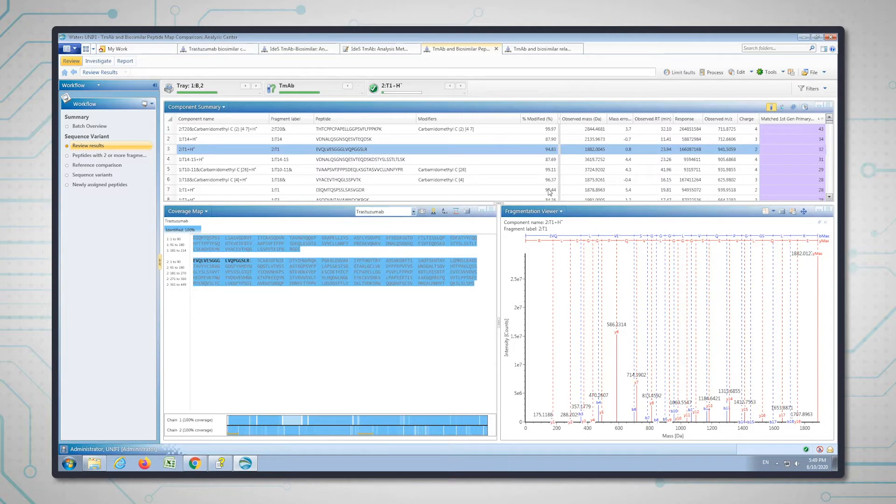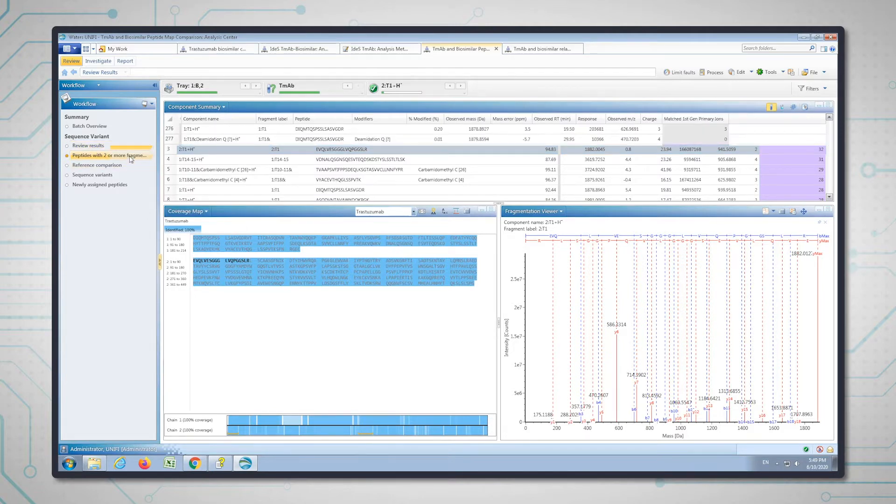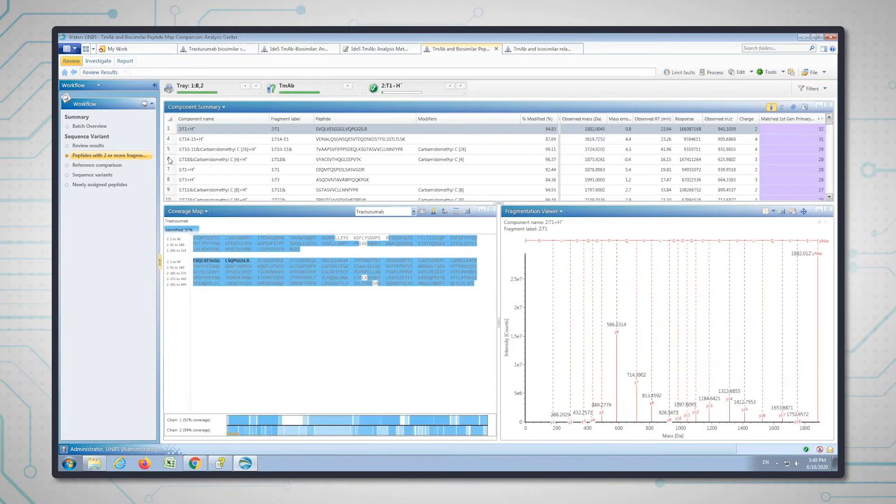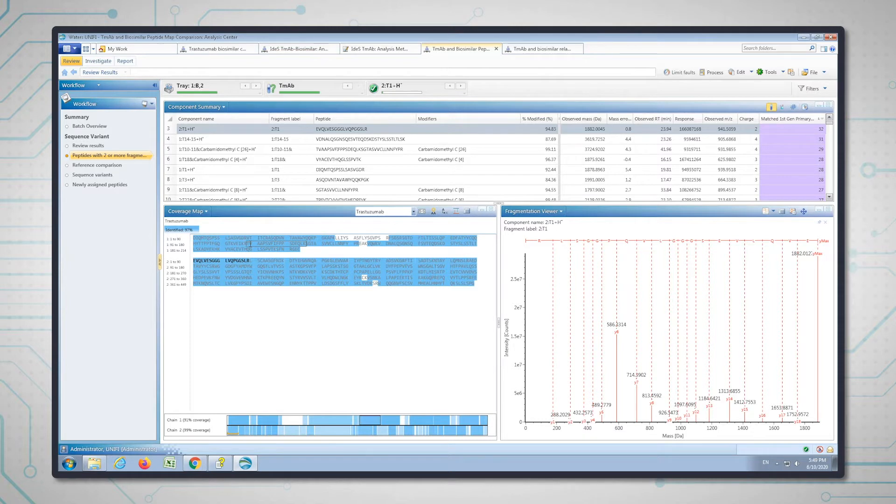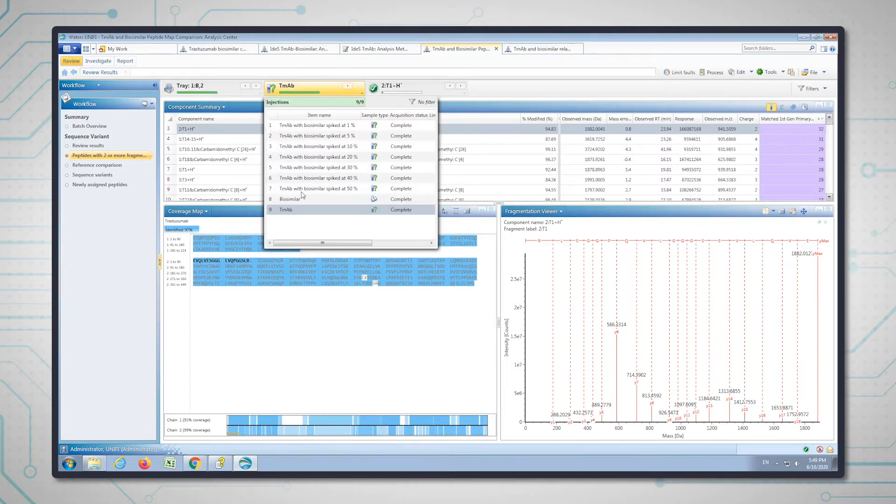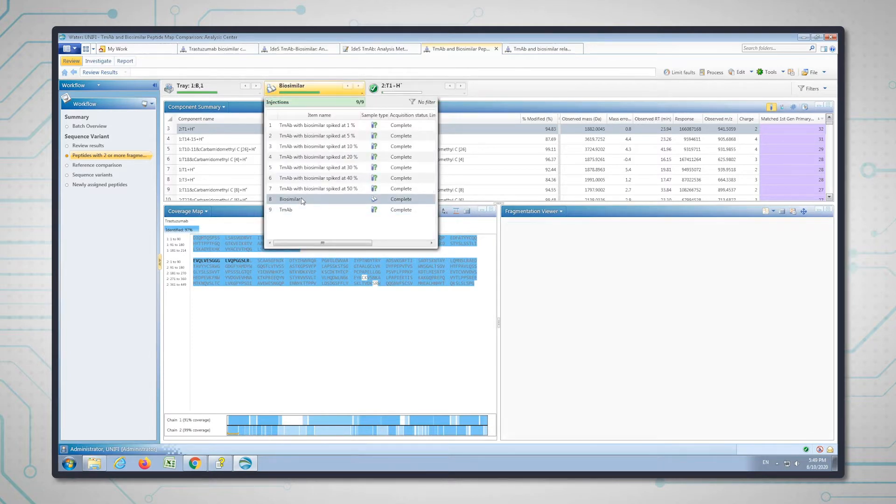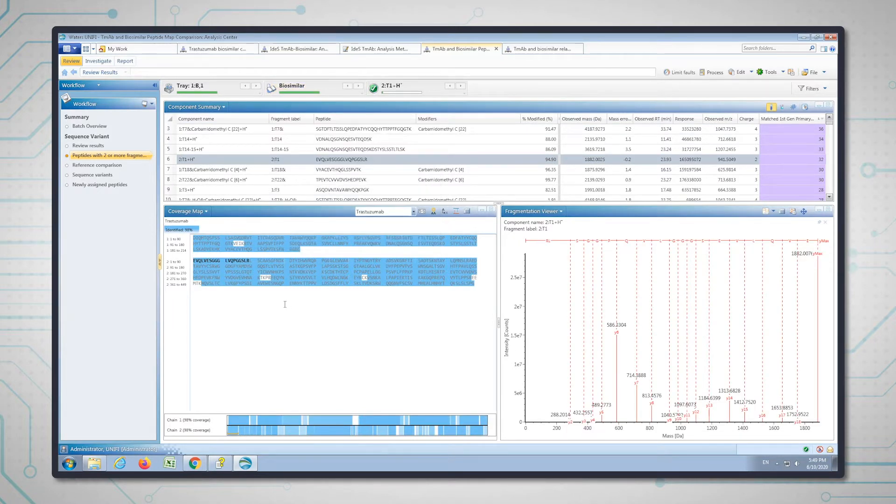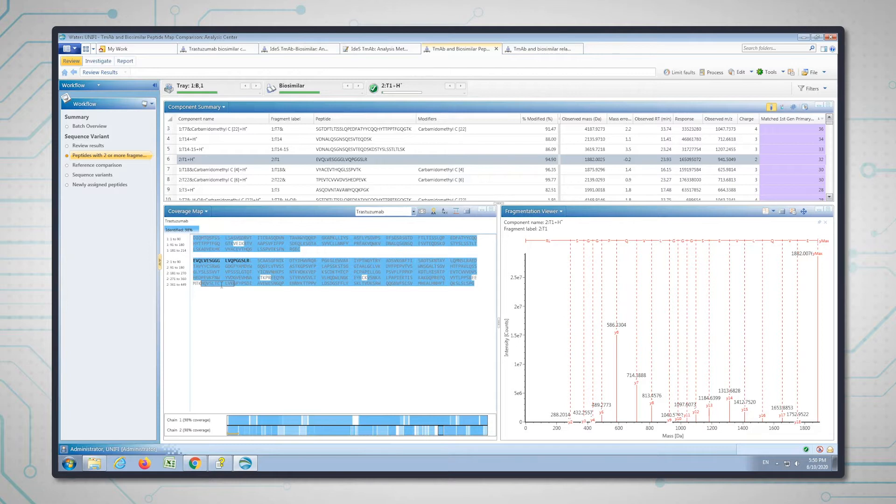In the second workflow step, I've applied a filter to show coverage when at least two fragment ions are present, which adds confidence to the peptides we're seeing. At the moment we're looking at the trastuzumab molecule. If I switch to the biosimilar, you can see that there are a couple of regions in this molecule that have gaps, which might be the regions that have the different sequences or sequence variants.